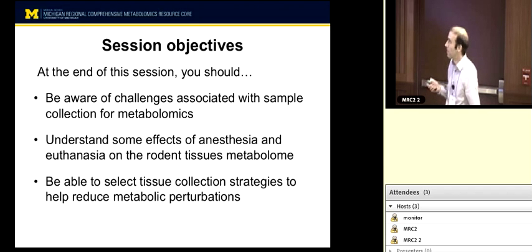Then we perform metabolomics, and as Maureen had mentioned, and others who talked today, the first step with metabolomics of tissues, when you have enough of it to work with, is to cryopulverize them. So we keep this stuff frozen. We grind it to a powder to aid in extraction. We'll weigh out a specific amount of it that we need. We'll add an extraction solvent. We'll sonicate or do some other tissue disruption strategy. If we're doing really high throughput, we can do a homogenization strategy that puts all of this into one step. We'll pellet the precipitated protein and other sample debris. We'll collect our supernatant containing the metabolome, run it on the LCMS, and then we did targeted and untargeted metabolomic profiling to look at differences.